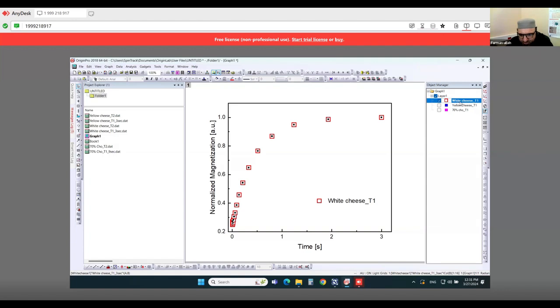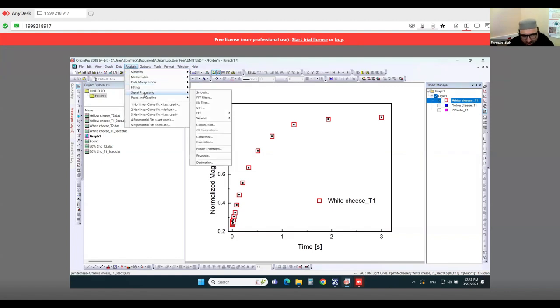If you do not select from here, it will fit the one which is already selected. So you must know what your target is. If I want to fit this, I will select from here. If I want to fit that, I will select from there. This is the rule of fitting.